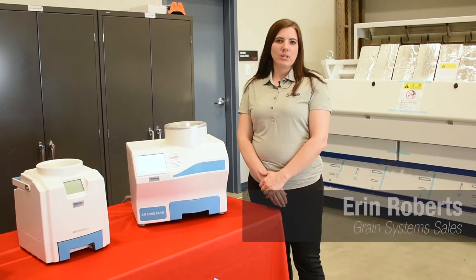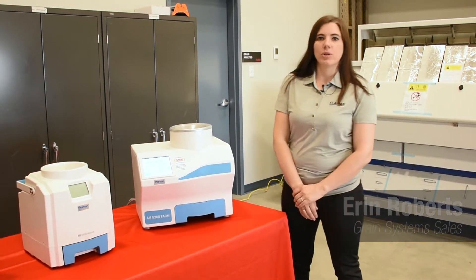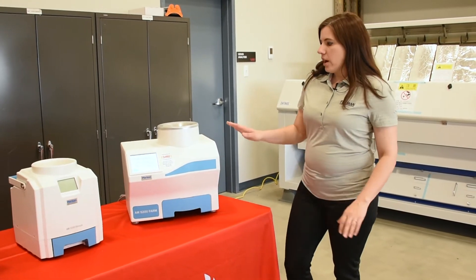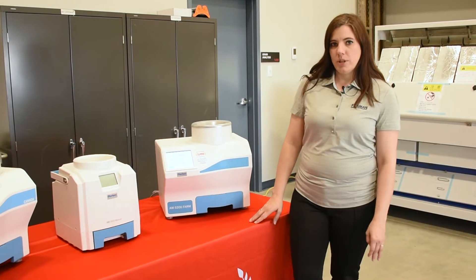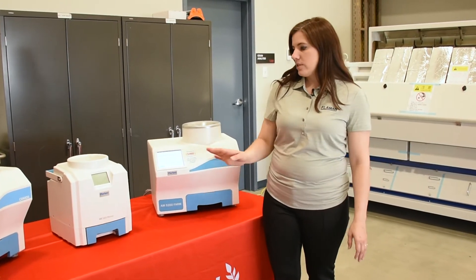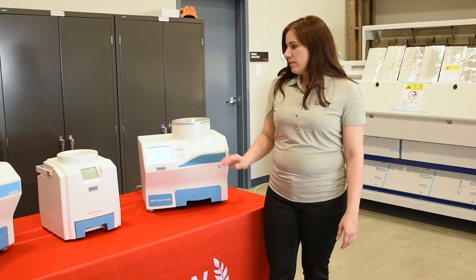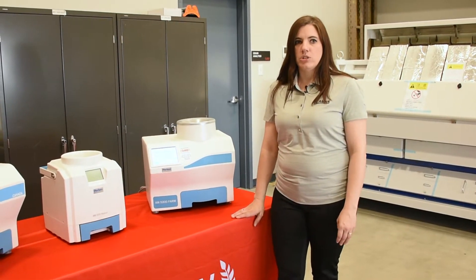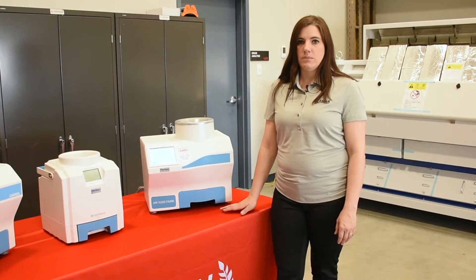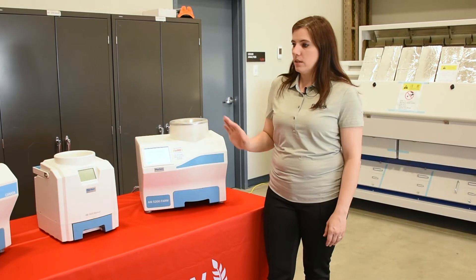Hi, I'm Erin from Flaman Grain Systems in Saskatoon, and I'm going to show you our three Perten moisture meters. Perten has a line of the Aquamatic moisture meters: the AM5200 and the AM5800. All of these meters use UGMA, Unified Grain Moisture Algorithm, and 150 megahertz of radio wave frequency to determine the moisture in the grain.